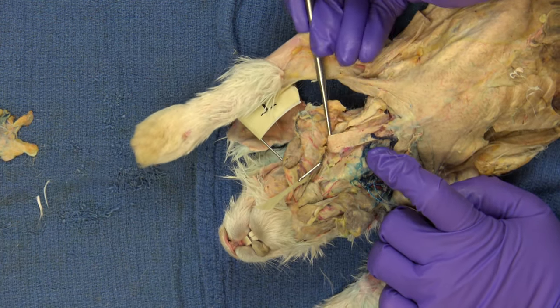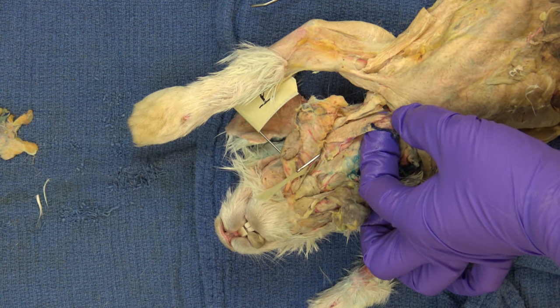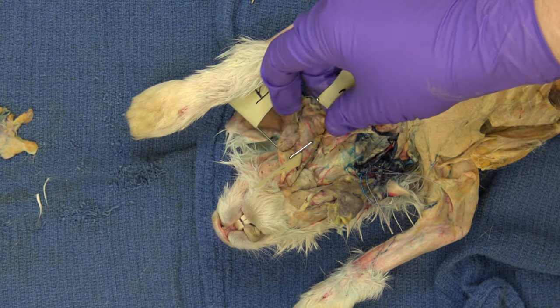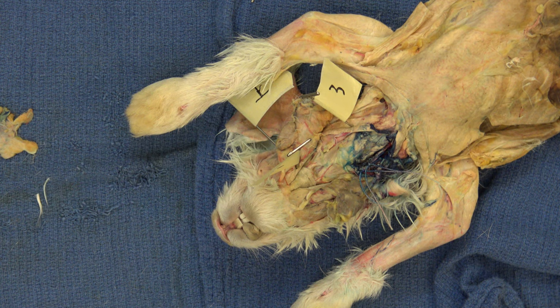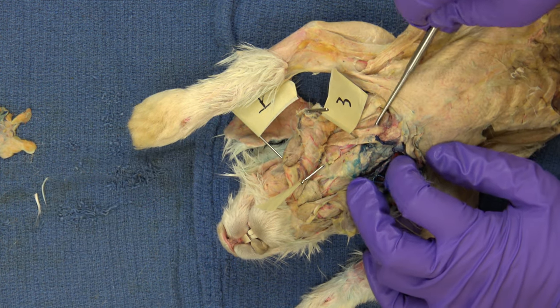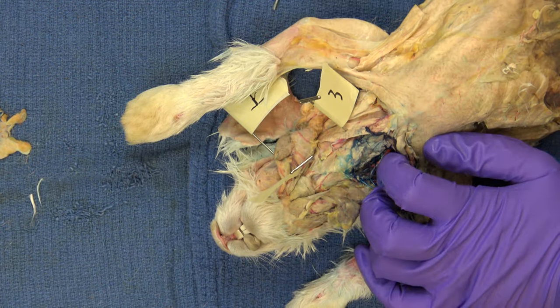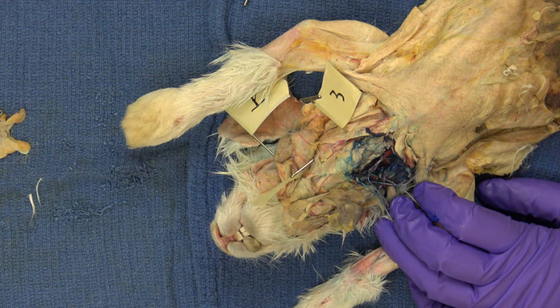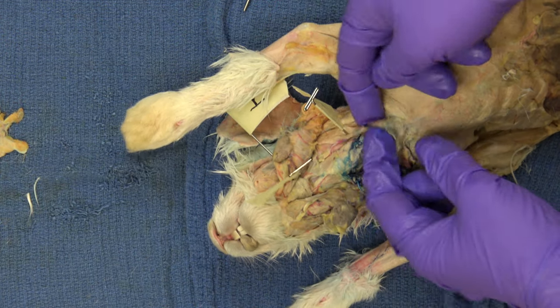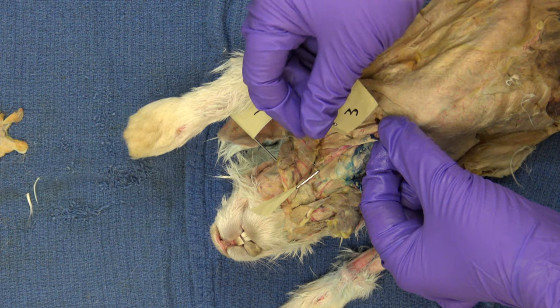Muscle three on the list is this one, and it has a long name. On the list it says sternocleidomastoid — it might just be sternomastoid in different dissection guides. Long names in muscles are really good. This is the sternocleidomastoid, or just sternomastoid. It is a muscle that runs from the sternum to the mastoid process of the skull — the name tells you its origin and its insertion. It's one of your neck muscles and it moves the head side to side. So those are the head muscles you have to know.